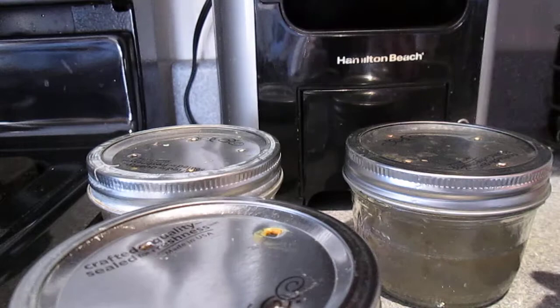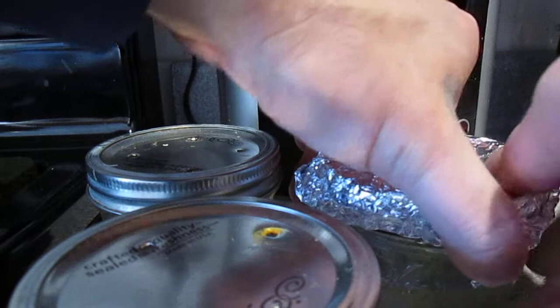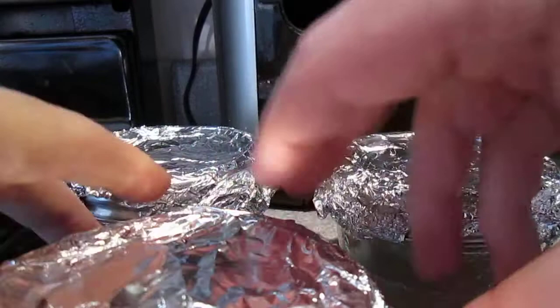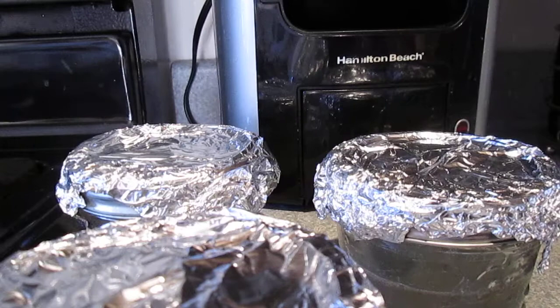I pre-made some aluminum caps out of tin foil to go over the top of these jars for when they go inside the pressure cooker, to keep any moisture from getting inside. Once I have the lids on, I'll pop them right inside this pressure cooker. This pressure cooker runs at 15 psi for about 90 minutes, and that'll sterilize them — then we can begin to pour.